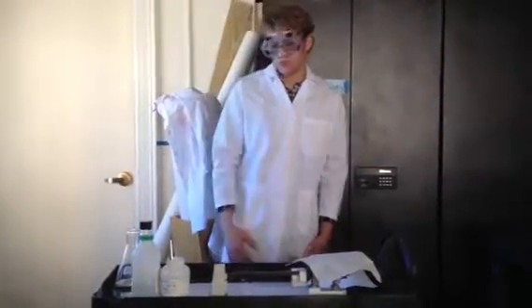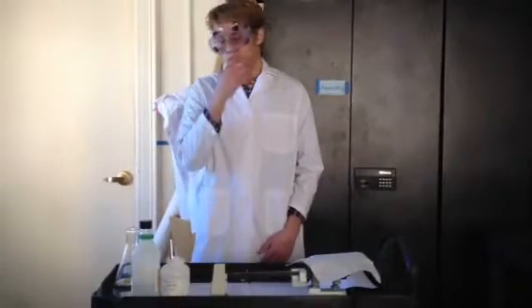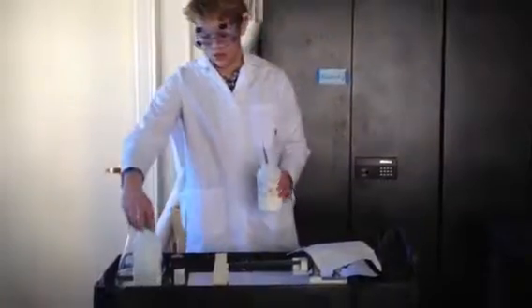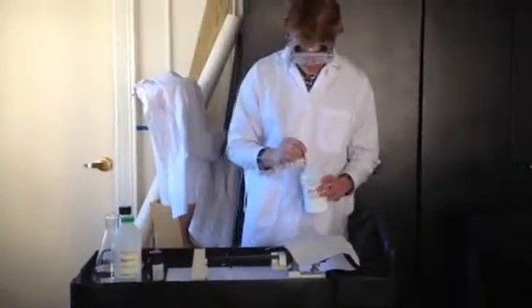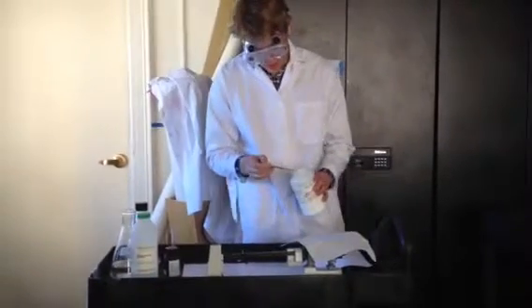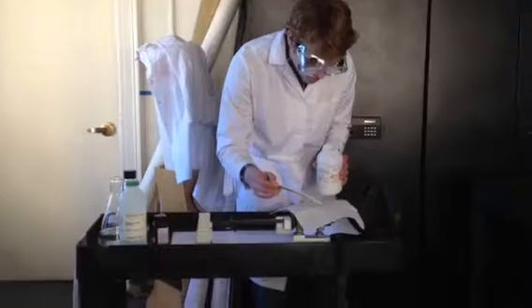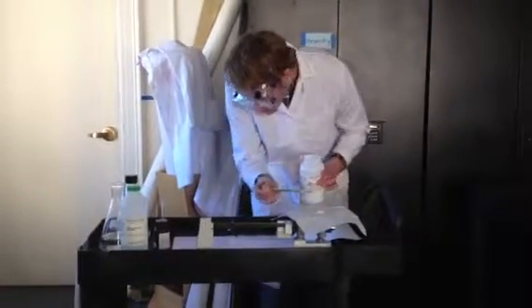And what we're going to do is a color change reaction, which is a redox reaction. We're going to use dextrose and sodium hydroxide. Now what happens is we're going to take 2.5 grams of dextrose.